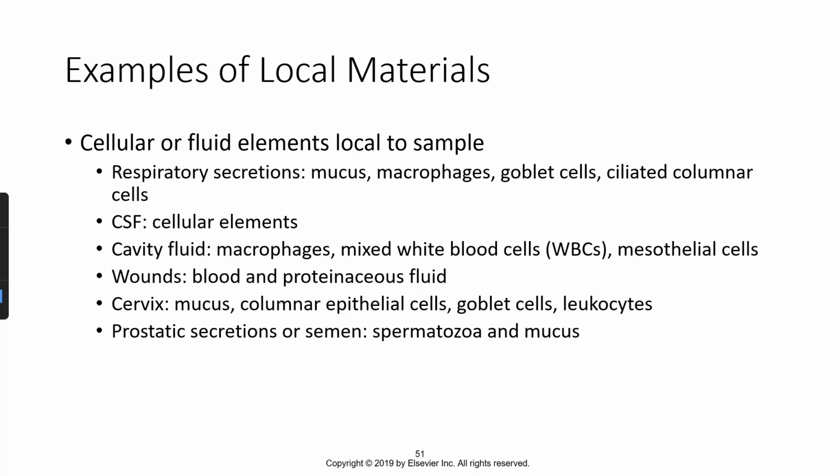And the main thing that separates you from the computers and guarantees that you'll always have a job is your ability to question things. And when you got into this field, you knew that this was a science field. You're going to be working in the laboratory, and scientists, that's the number one thing they do, is ask questions. So if something doesn't make sense or something doesn't look normal, ask why and do some investigating and do some digging. Don't just follow protocol and process results. Always think about what is going on, what's the specimen source, and does it make sense for the specimen source.